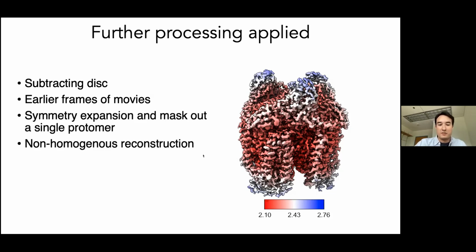And also, I did this work in CryoSPARC as well, and did the non-homogeneous reconstruction, and got a very similar looking molecule and very similar looking Pmoc site as well.